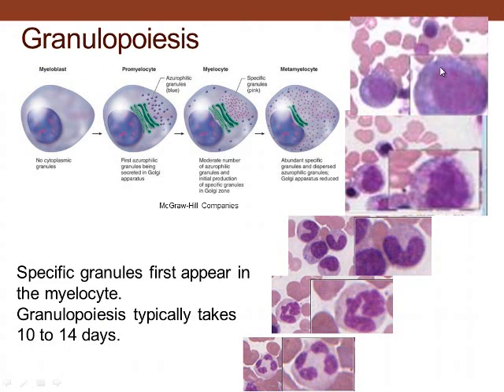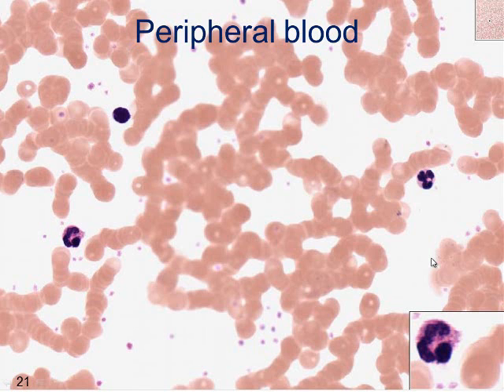So this is the cytoplasm with just some granules, kind of bluish, but then you pick up more granules, the cytoplasm becomes gray, the nucleus becomes sickle shaped, and then becomes lobulated for the complete cell. So the nucleus becomes condensed, as you see, and it becomes lobulated, and the cytoplasm goes from blue to mostly granules in the process.